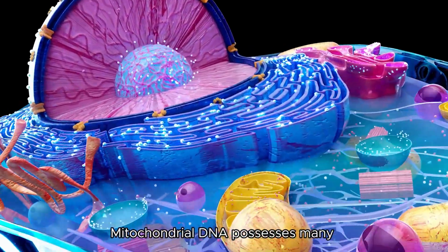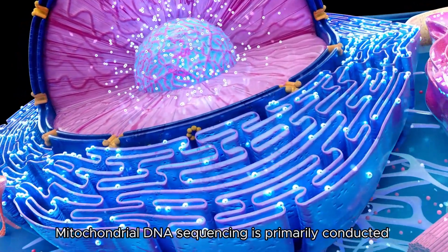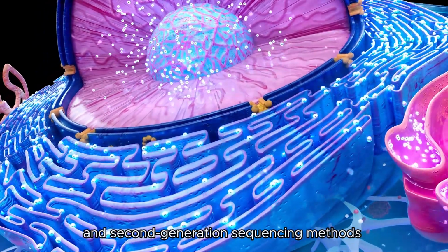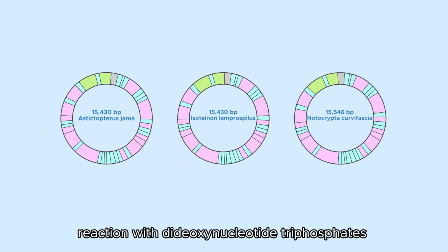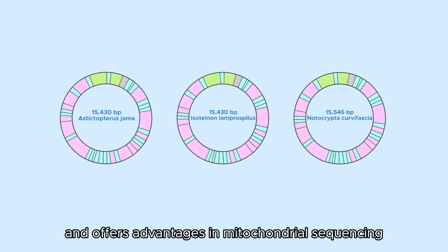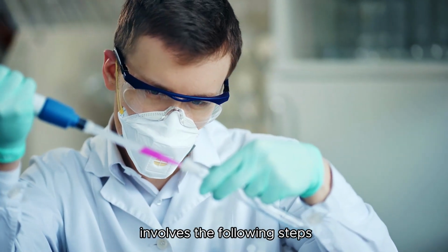Mitochondrial DNA possesses many unique characteristics and irreplaceable functions. Mitochondrial DNA sequencing is primarily conducted using traditional Sanger sequencing and second-generation sequencing methods based on DNA synthesis. Sanger sequencing relies on the termination reaction with dideoxynucleotide triphosphates, ddNTPs, and offers advantages in mitochondrial sequencing, including longer read lengths and high accuracy. Mitochondrial DNA sequencing involves the following steps.